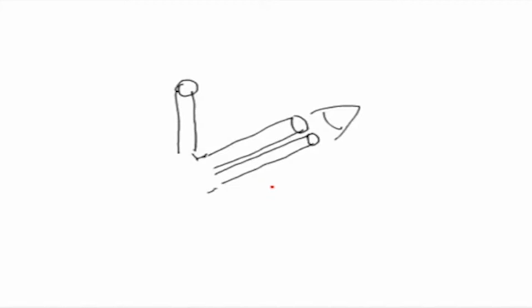The trinocular port, where you have three eyepieces, could be used for different purposes. For example, when two persons would like to view the object and the image simultaneously, like a student and teacher, where the teacher is either examining the student or explaining a particular sample or specimen to the student, then a trinocular port could be utilized.